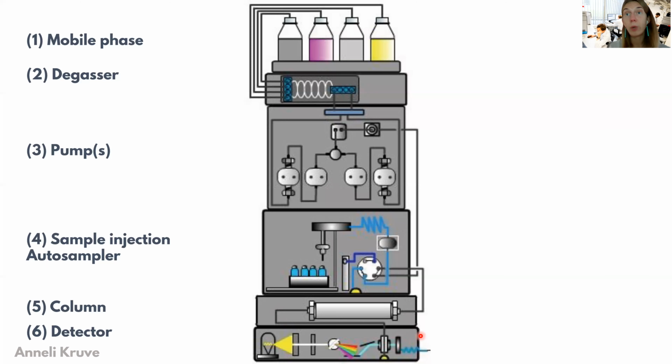What can also be done, and what is very often done, if we use ultraviolet visible spectroscopy detection in liquid chromatography, is that we often use array detectors. This means that we register the full spectrum at once, which is extremely beneficial if we want to detect multiple compounds, or characterize our compounds based on where they absorb, or get additional confirmation by having the full signal of the compounds available.